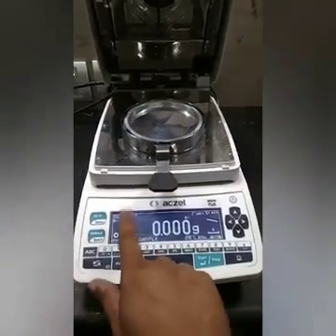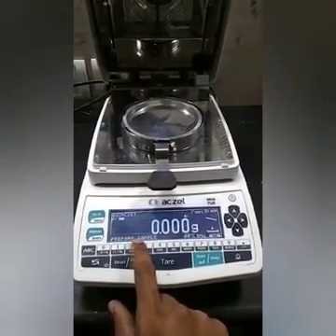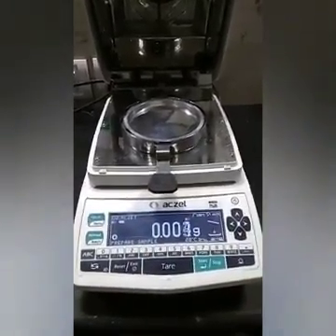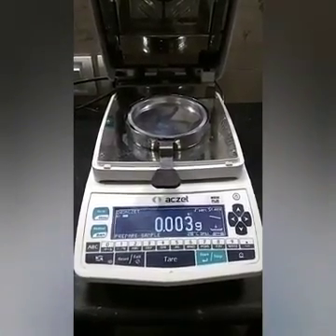Now it is showing 'prepare sample'. We have to put the sample on the pan. You can take around two to five grams of sample on this dish.